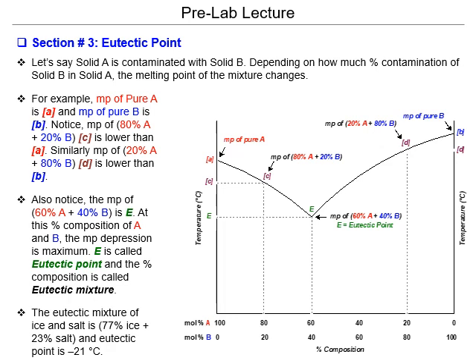Okay, for a mixture of different substances, we can say we'll have a solid A and a solid B in our example on the screen. Solid A is contaminated with solid B, but depending on the percent contamination of B and A, the melting point is going to change. Now we can graph all this. You would take a bunch of measurements using known quantities of these substances, and make a graph of the melting point versus the percent compositions of each of your two compounds, A and B.